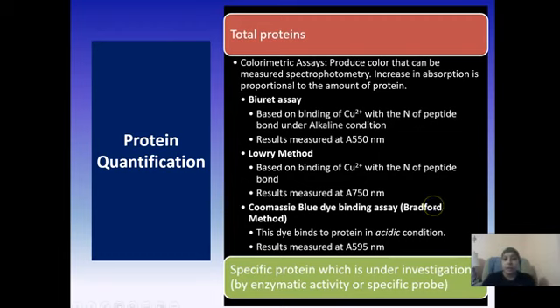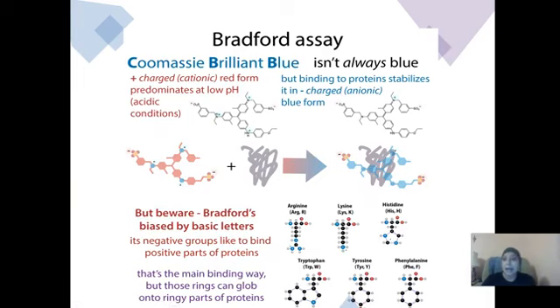We're going to be using this assay in this class because we want to see all those different ways that your standard curve can show up, and we want to be able to understand how to choose the correct one under any specific conditions. So just to remind you again, the Bradford assay is based on the Coomassie Brilliant Blue dye binding with your proteins.